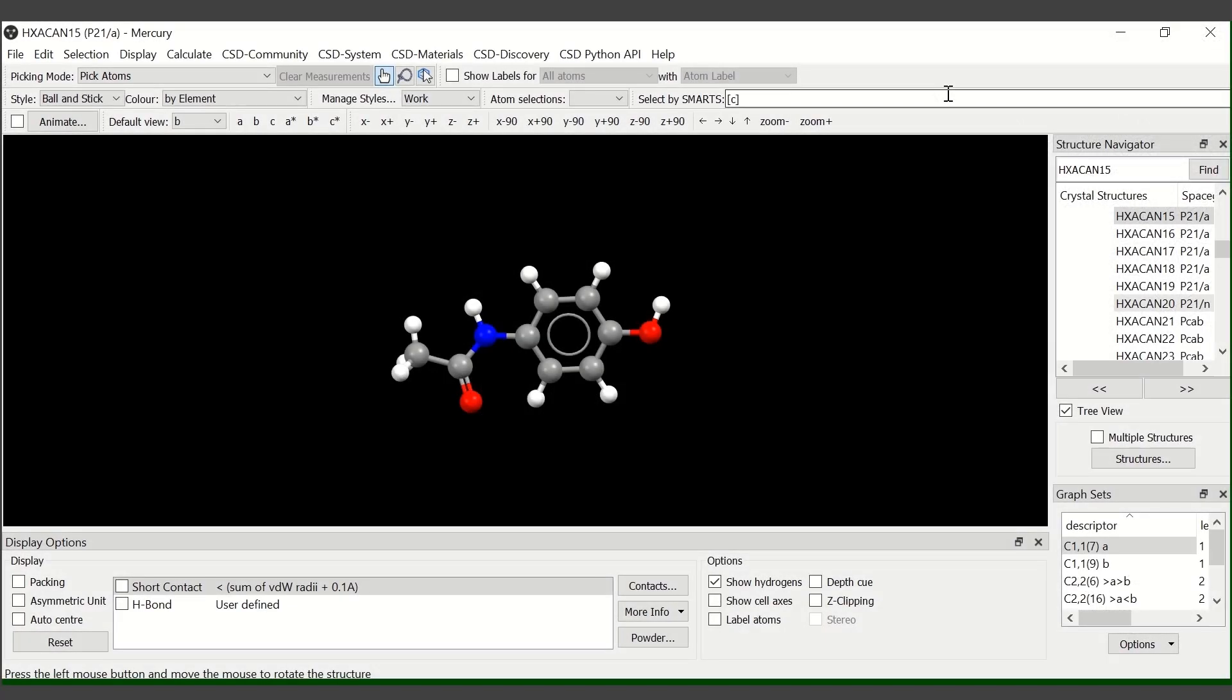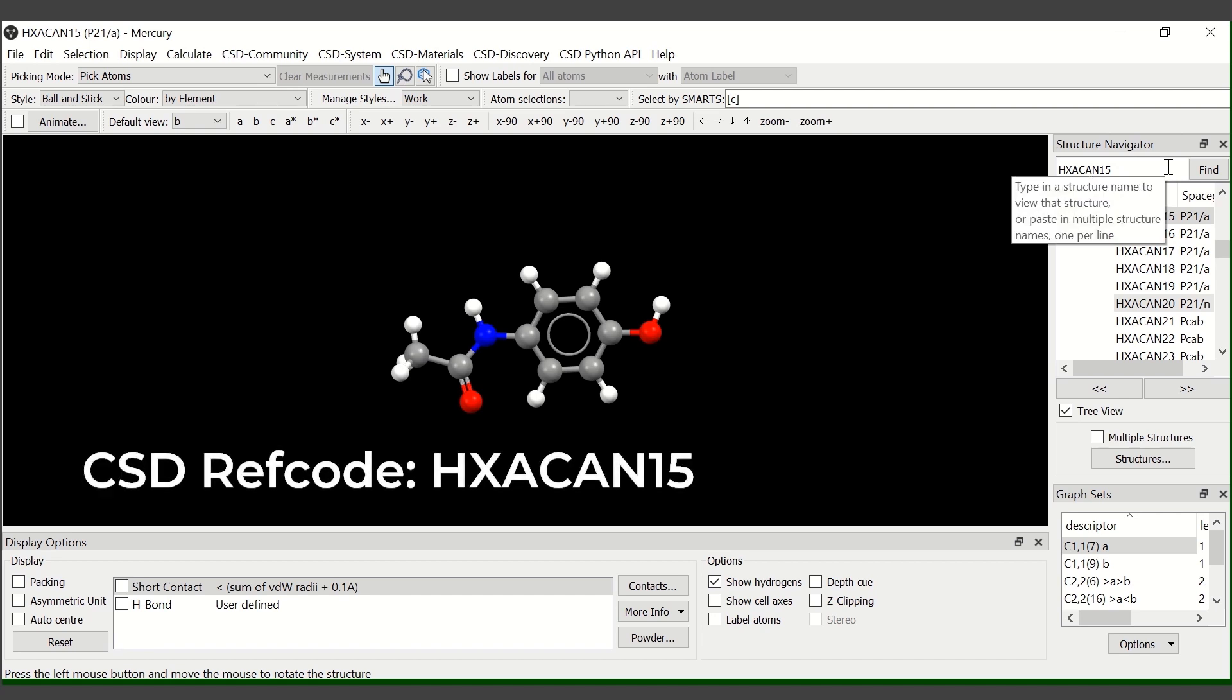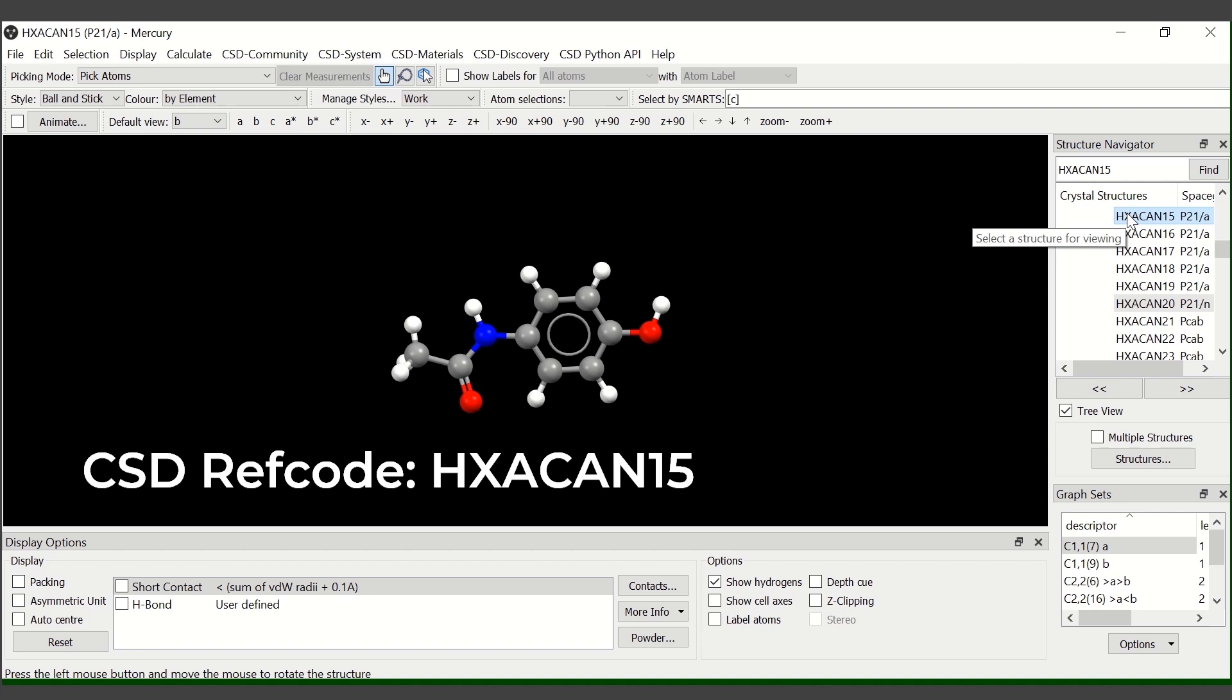Once we've opened Mercury, we insert the RAF code for the structure we are going to investigate in the structure navigator. The molecule is paracetamol and the RAF code for the structure is HXACAN15.